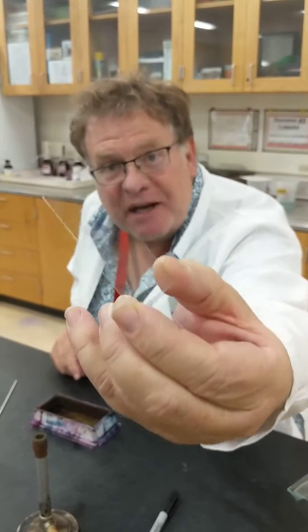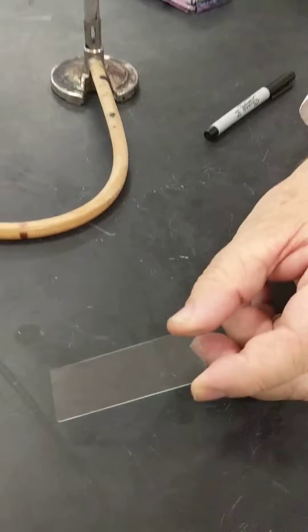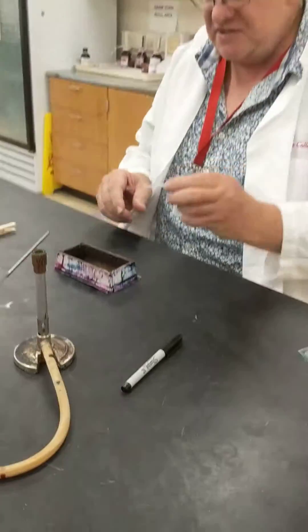If you look at the slide, you can see the little smear on there. And you can see a little bit of smear — that's the bacteria that we put on the smear.